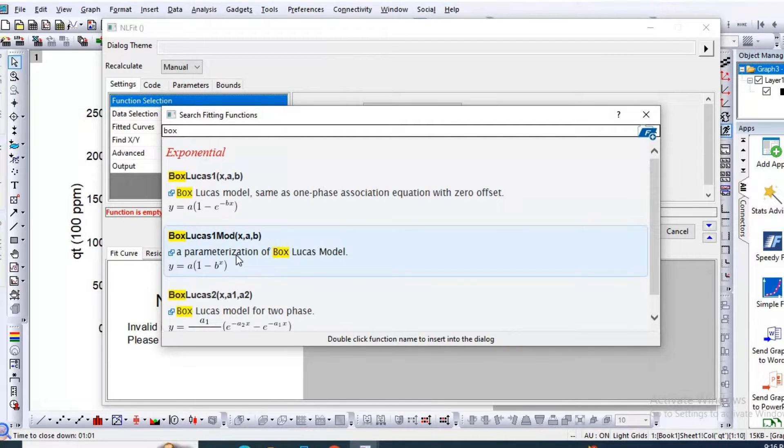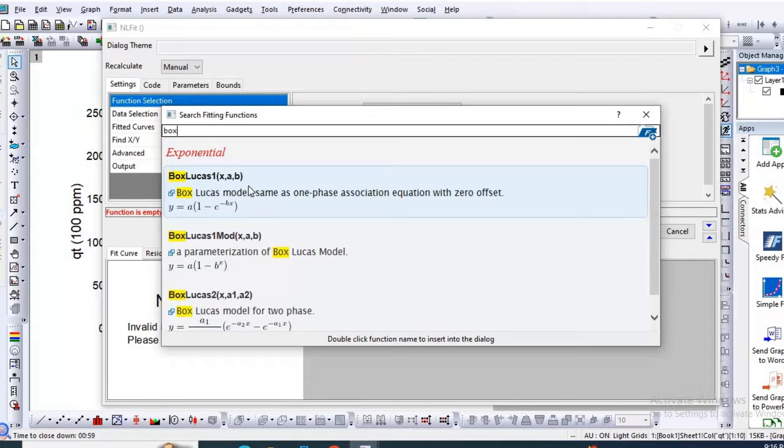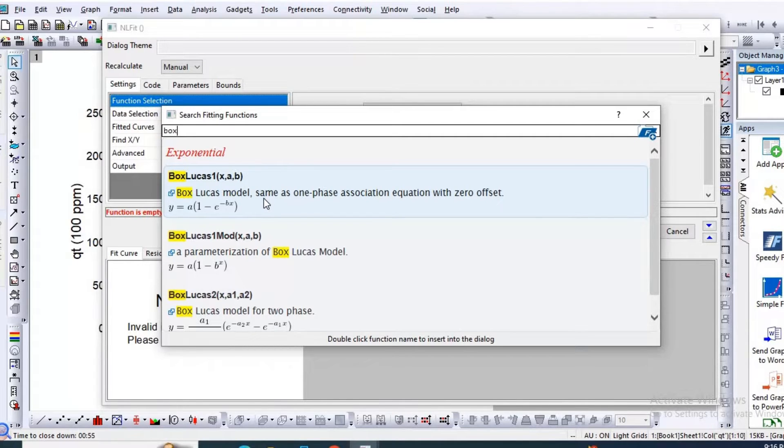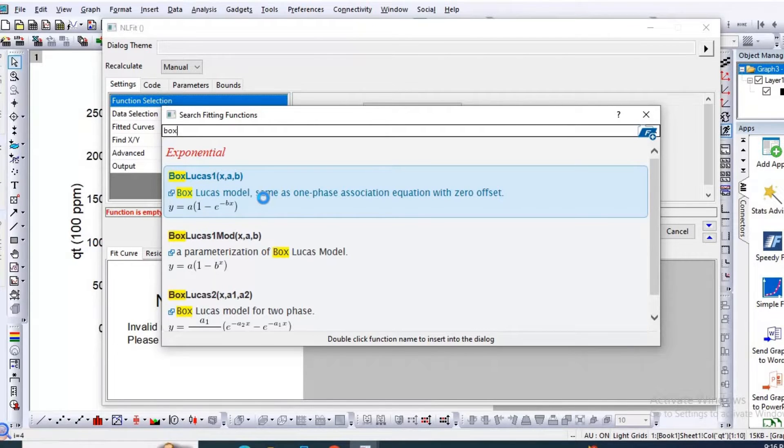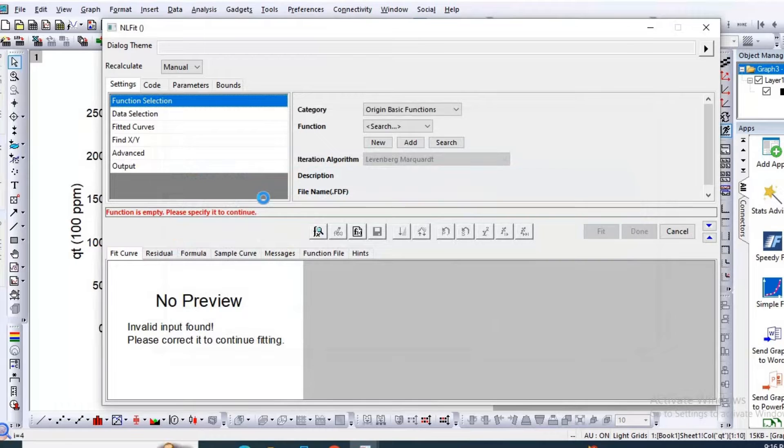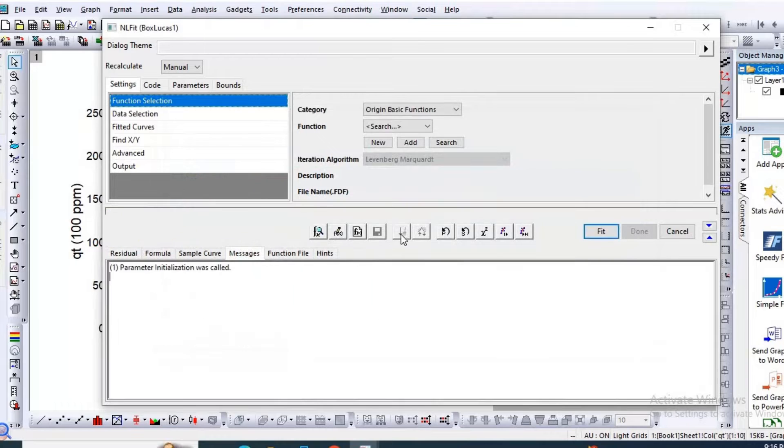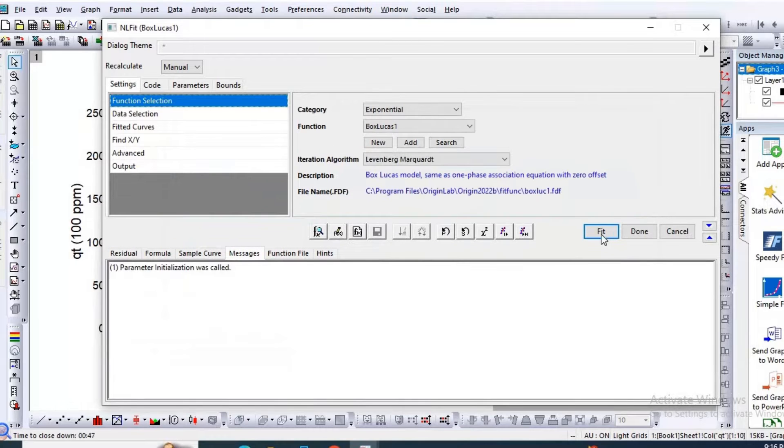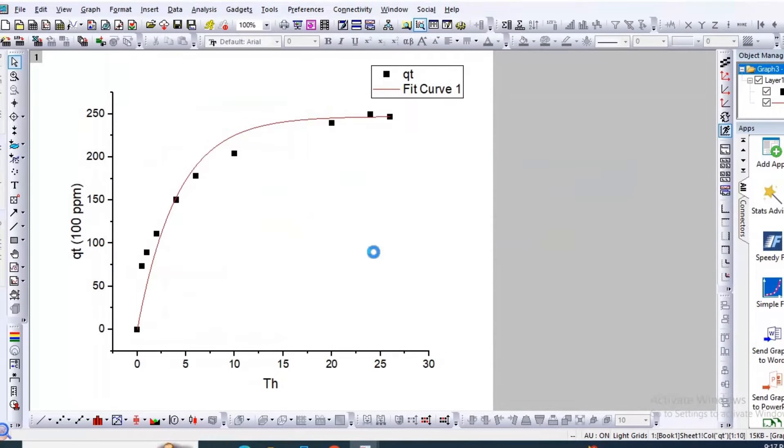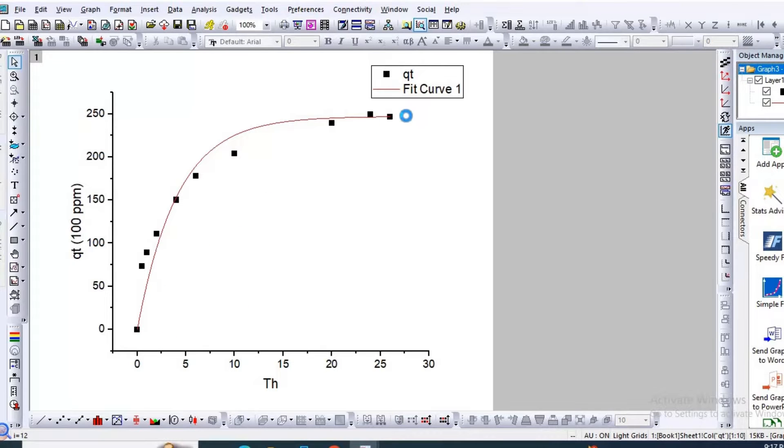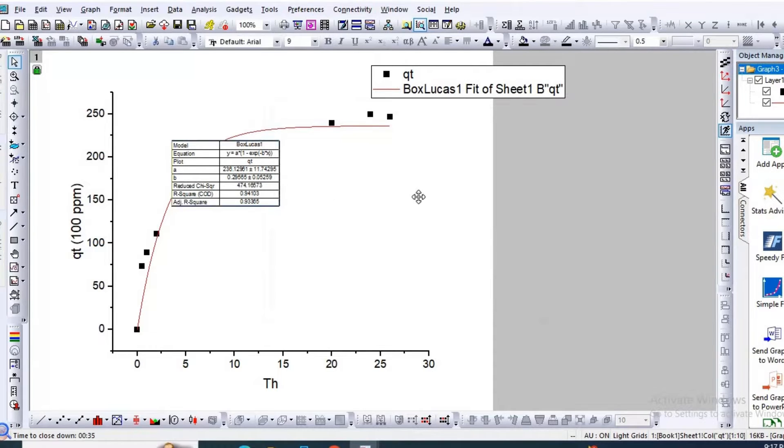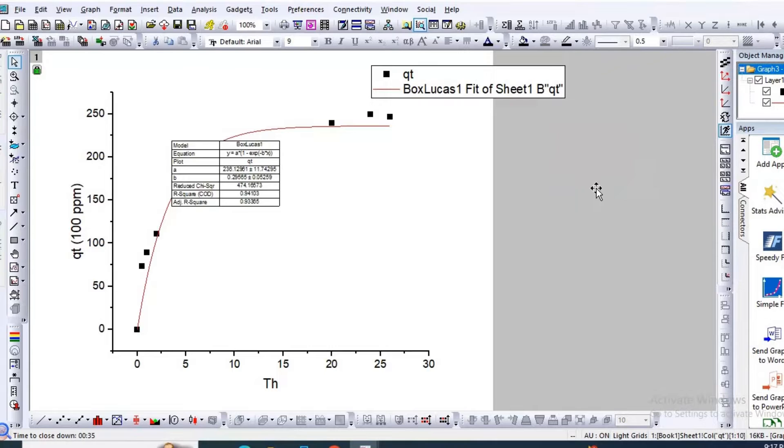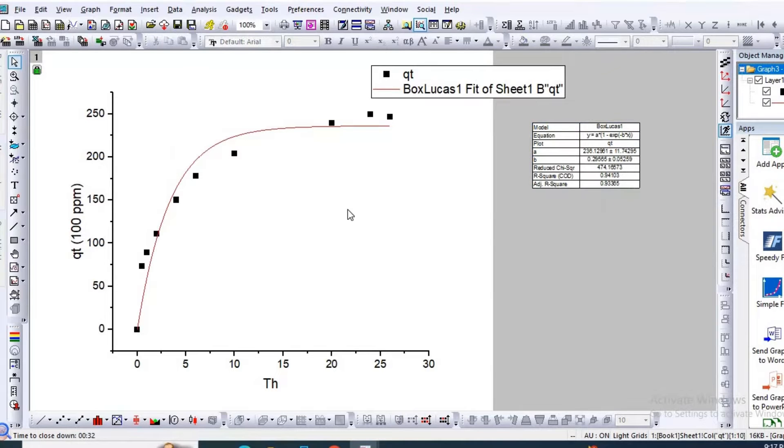Box-Lucas, this is Box-Lucas-1. This is the pseudo first order equation. So double click on it. Click Fit. So this is the pseudo first order equation. Then click No, then OK. So here is your pseudo first order equation.